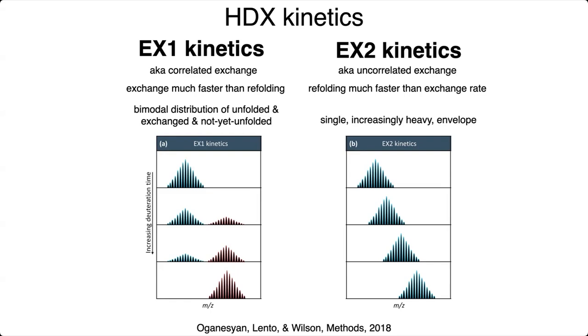When that happens, the protein is going to be permanently marked. If you imagine that you were doing your cannonball into a pool of paint rather than into a pool of water, parts of you are going to get painty. And even if you were just to dip in really quickly, you would get painty. And if you were to stop dipping and get out of the water, you're still going to be painty. And so the protein, every time it opens up, has a chance to get one of those marks. It has a chance to get a drop of paint on it. And when it gets a drop of paint, well, now it's permanently painted.